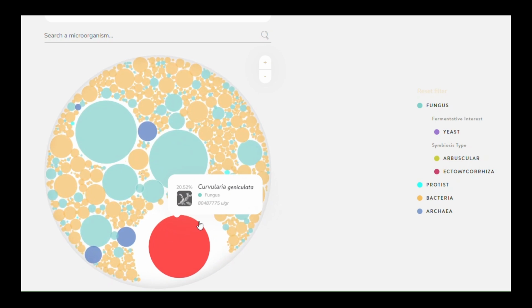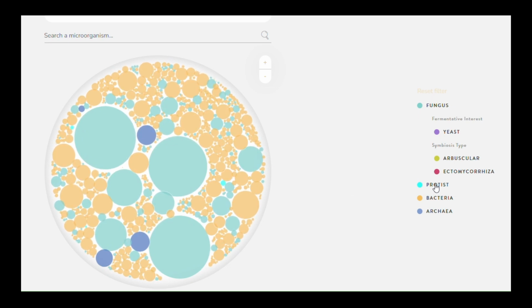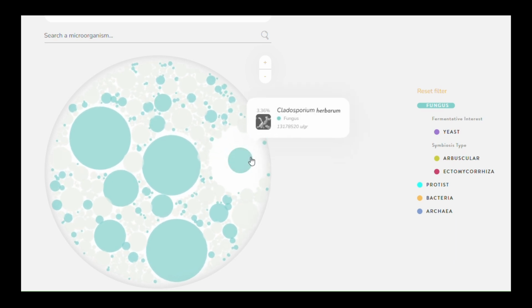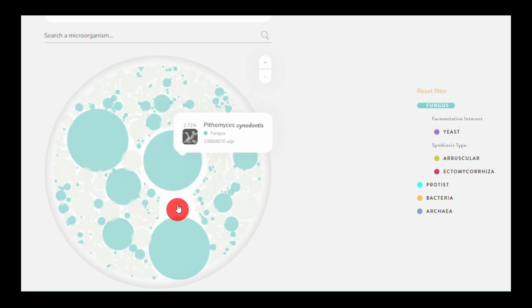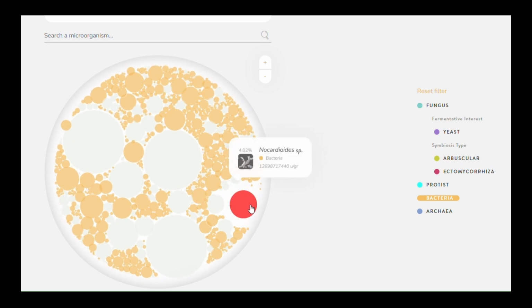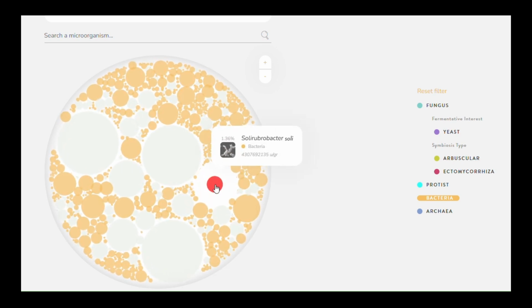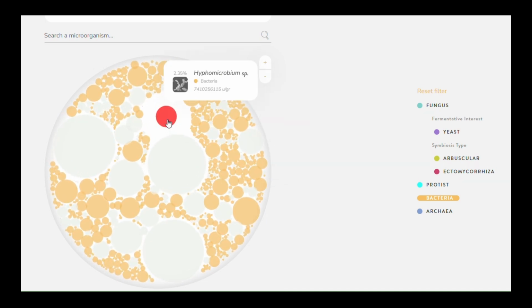transplanting. This deep dives into an interactive view of millions of possible microbe combinations, good and bad, so that we can prepare ourselves to enhance the soil or increase certain microbes to enable us to be resistant to stress, sometimes pathogens, sometimes bad fungi and bad bacteria compared to the good ones.